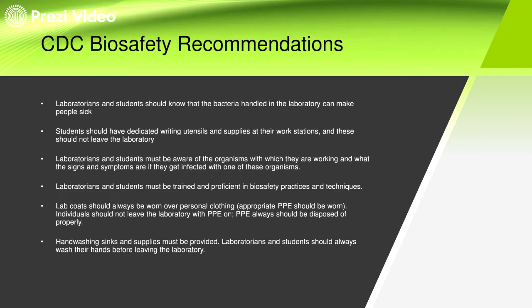When you leave the room where you work, the lab gown stays there. The gloves stay there, the mask stays there. It is not brought out to the hallway. Okay? So, PPE should always be disposed of properly. So, hand washing facilities and supplies must be provided. Laboratorians and students should always wash their hands before leaving the laboratory. So, when we get to face-to-face classes, we have exercises regarding proper hand washing. So, what is the proper hand washing technique when you are a medtech? You will study all of that in MLSP 2.